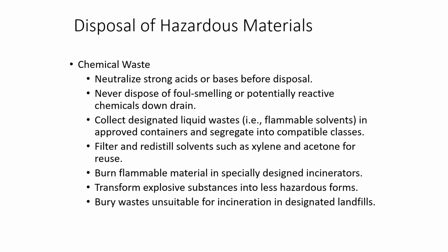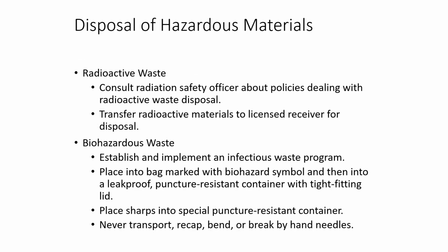Filter and redistill solvents such as xylene and acetone for reuse. Burn flammable material in specifically designated incinerators. Transform explosive substances into less hazardous forms. Bury wastes unsuitable for incineration in designated landfills. For radioactive wastes, you should consult a radiation safety officer about policies dealing with radioactive waste disposal. Transfer radioactive materials to a licensed receiver for disposal.